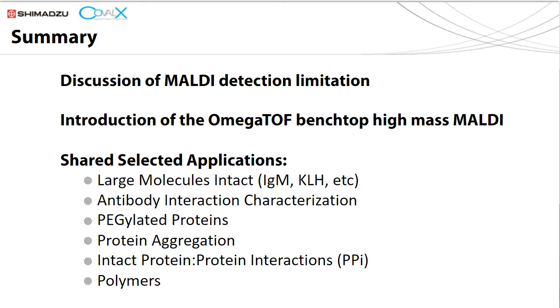Then moved into some antibody antigen interactions, showed different stoichiometries, some small antigens of a few kilodaltons up to several hundred kilodalton antigens into the half megadalton range, different antibodies from simple MABs to bispecifics with 1-to-1 stoichiometries, or divalent antibodies with 2-to-1 stoichiometries. Some examples of covalently PEGylated proteins were then shown, showing the distribution of the PEGylation across the proteins.